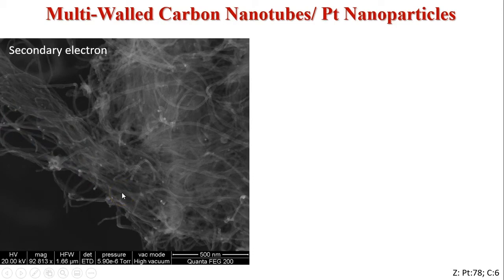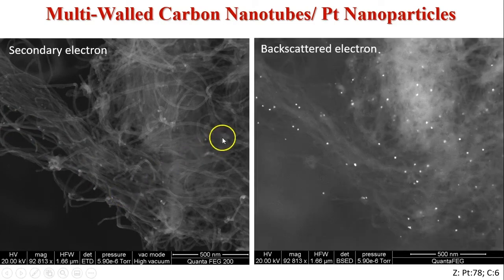How does it look under the backscattered electron detector? It's very obvious: this is the one-dimensional structure, not that obvious, but the nanoparticles stand out and have much better contrast if we compare. So that is very obvious, there are nanoparticles.